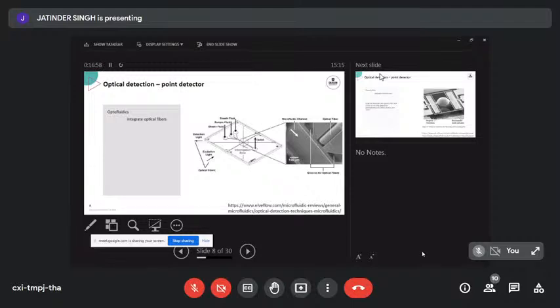We talked about those curtain flows yesterday. A sheath fluid makes sure that your liquid that you want to see stays really nicely confined in the middle of your channel. For detection, it's nice to be in the middle of the channel and not at the edges, because edges are never perfect and you get reflection of light and disturbance of your detection signal. So the sheath fluids there are to make sure we can do optical detection without being bothered by the defects of the fabrication.